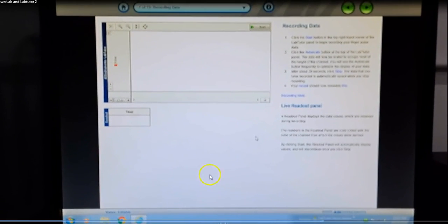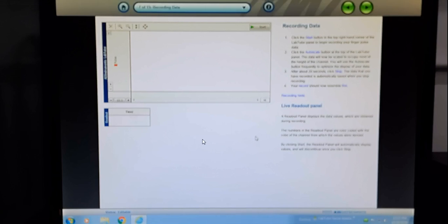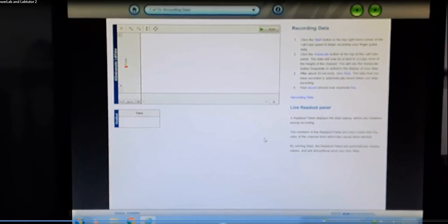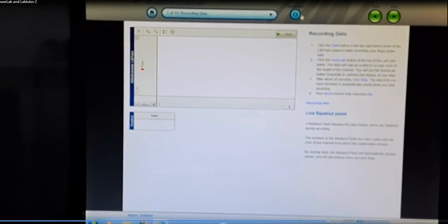Now, I am so sorry for the wonderful video that you are seeing right now. So this is what happens when you are a doctor and not a professional videographer. So let's see how we are going to record our data. This will clear up.